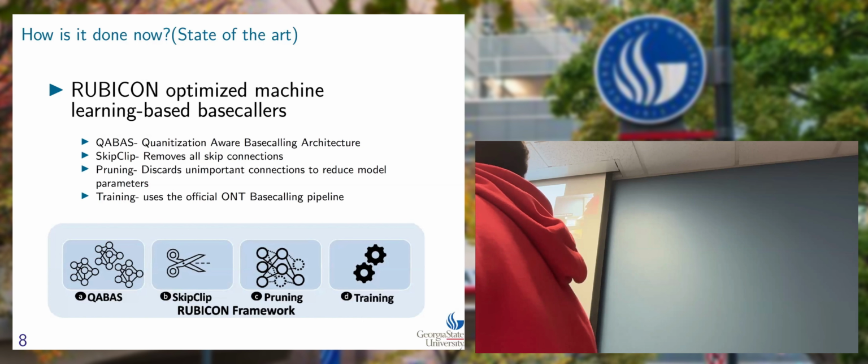Which ones were active? Which ones had their weights changed? Which ones were not? You do this not one time, not two times, but thousands of times. Every time you observe which nodes are used, so over time you know exactly what you need. I see.